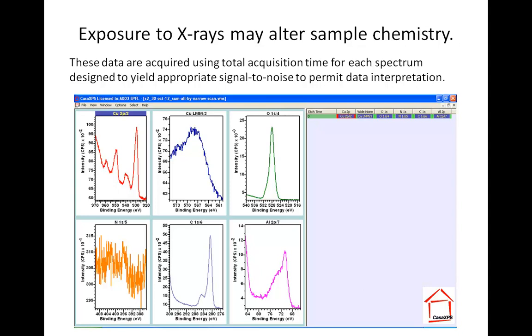Now, the problem that we'll encounter when trying to analyze these data is that we have different oxidation states for copper that are within this average spectrum, averaged over time, averaged over analysis area and depth. This represents an average spectrum that we will have to peak fit and try and understand the different shapes that are within these data that we'll then interpret as chemical state.